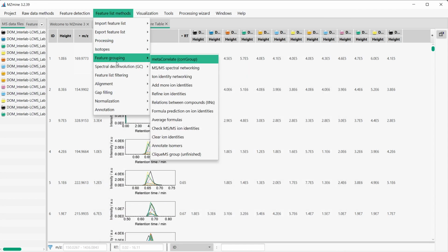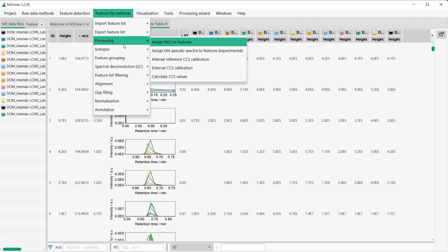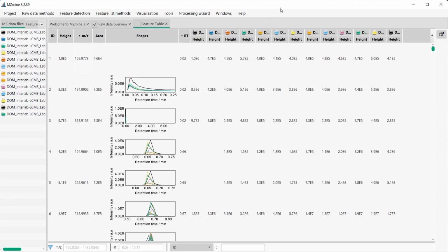And even if you don't find anything that's exactly what you want to do or similar to what you do, if you find a module that takes the same inputs, let's say, you can look at the parameters. You can see how we can get the user input, how I can process it, and how I can get the result, which is very similar to that module. Yeah, so in this case, we are just creating something completely new.